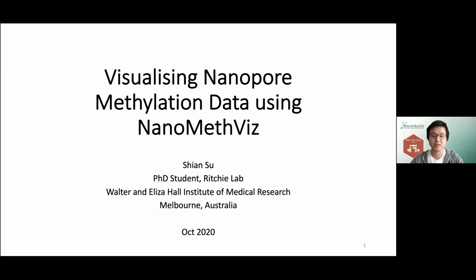My name is Shian Su. I'm a PhD student from the Ritchie Lab at the Walter and Eliza Hall Institute in Melbourne. And today I'll speak to you about visualizing nanopore methylation data using a package I'm developing called NanoMethViz.